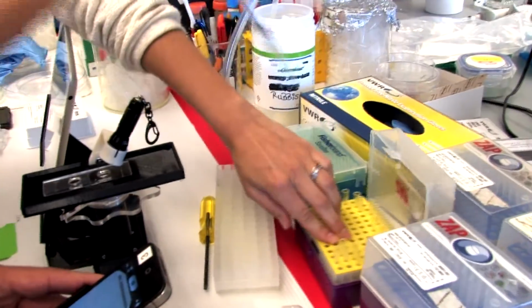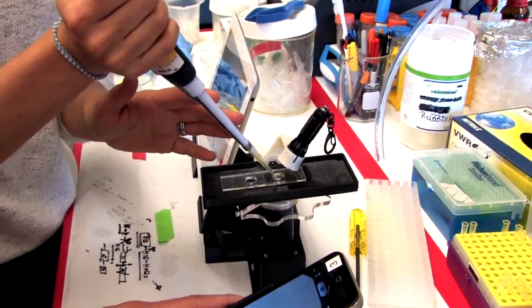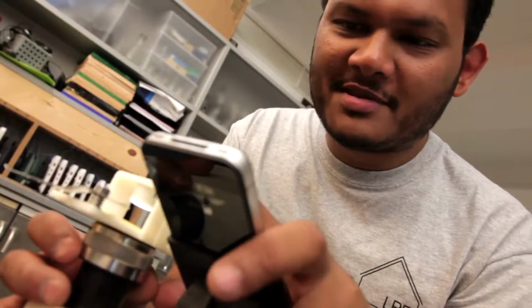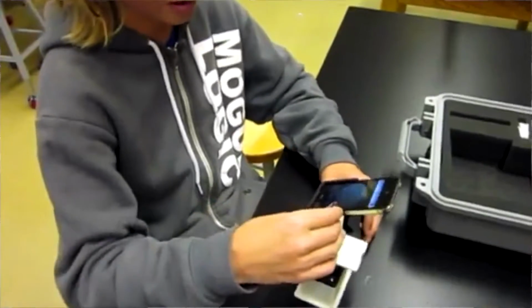The idea from there then was to do disease diagnostics in developing countries, and it got developed further and the team grew. And then just by a chance encounter with Sabar Khan, a middle school teacher who approached us, we had the idea of trying it out with kids for education.